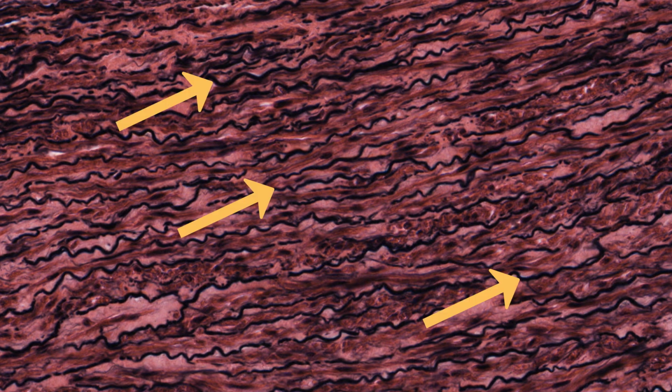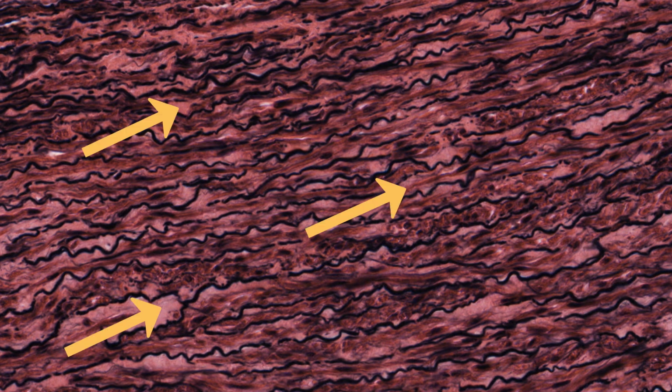We earlier saw that the muscular arteries are mostly smooth muscle to change the dimensions of the lumen and therefore the flow. Here, a lot of that smooth muscle is replaced by elastic tissue to do that recoil function I just mentioned. And the red staining material you see there is going to be collagen, as well as some small amount of smooth muscle. Elastic stains are a very important stain to use in some tissues to expose all the elastic tissue within that particular tissue.